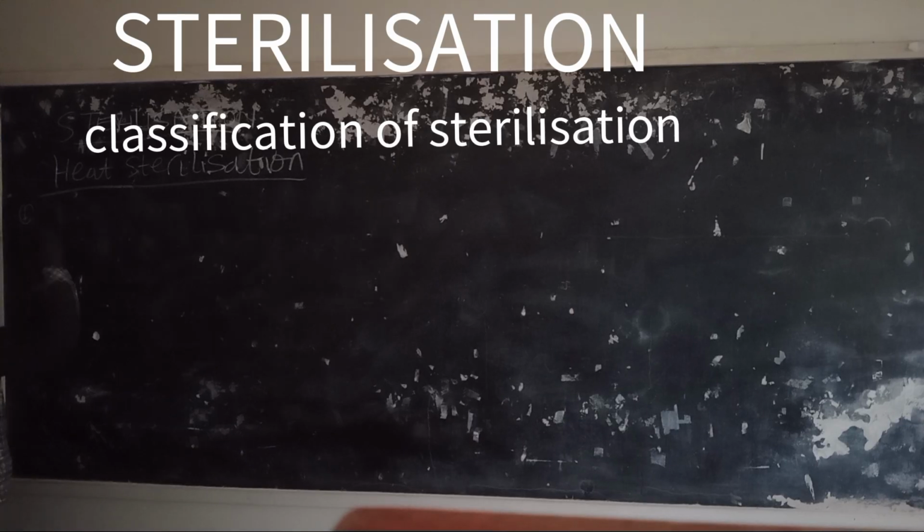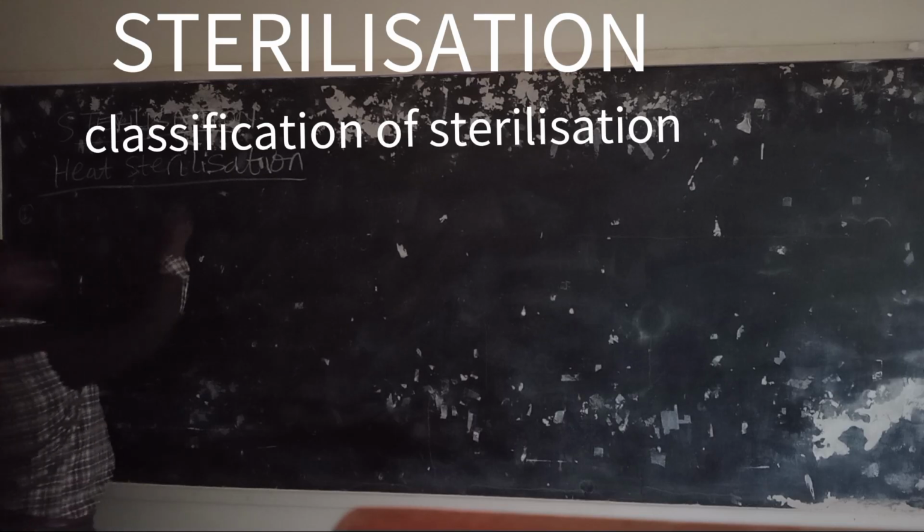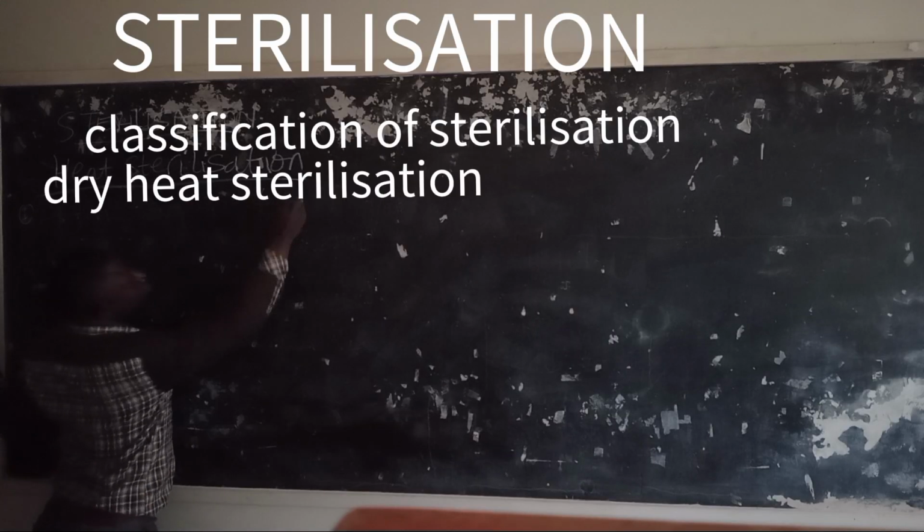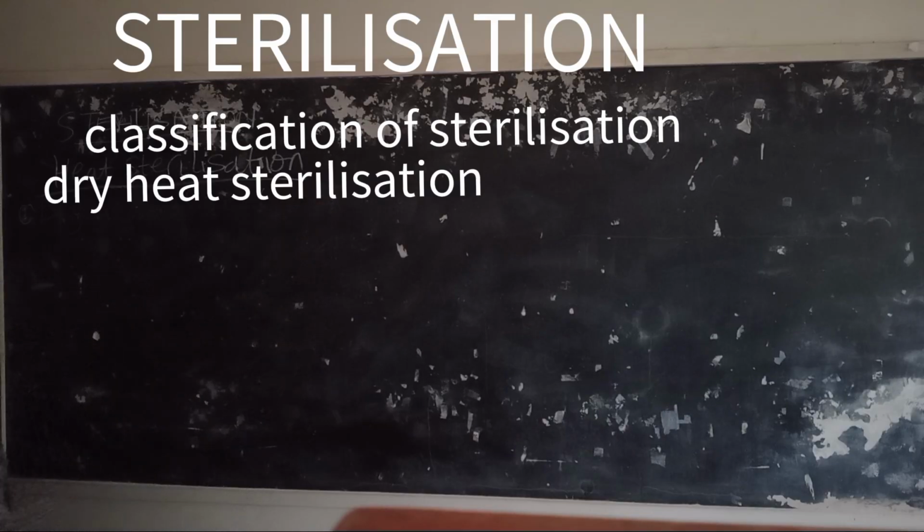So secondly, we talk about dry heat sterilization. With dry heat sterilization, you find that we have different categories here. We have flaming.